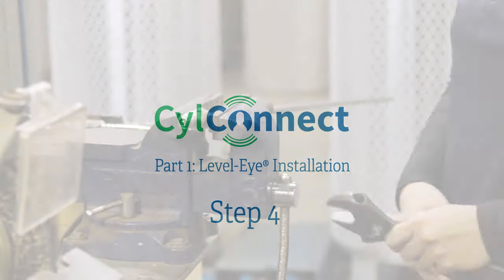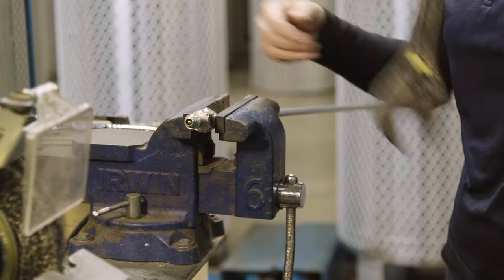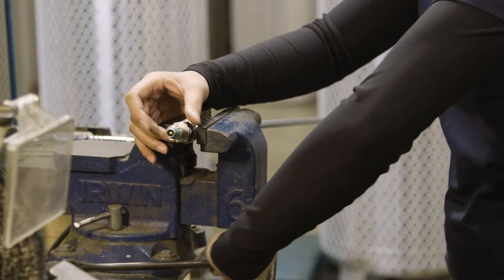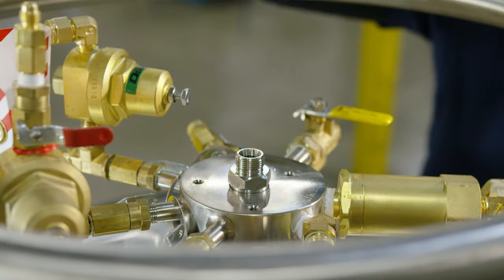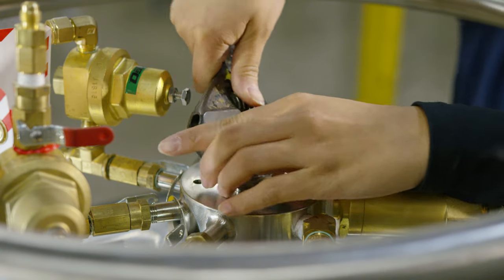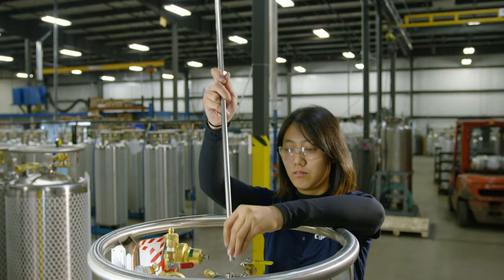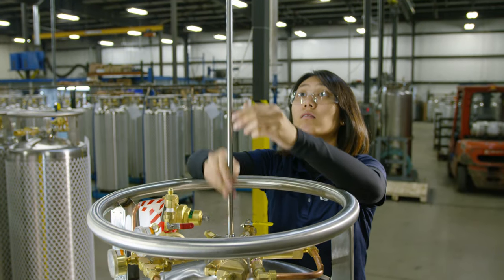Step four: the easiest method to install the wand is to remove the ceiling nut and thread it into the knuckle first. Guide the wand through the ceiling nut and retighten the compression fitting.